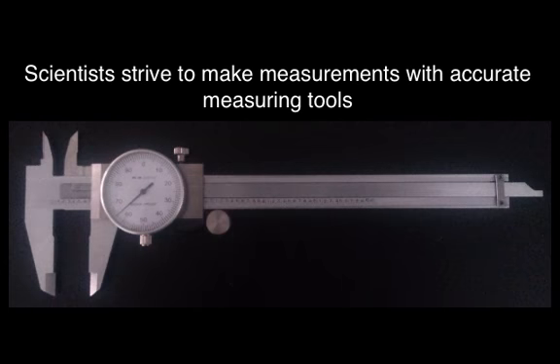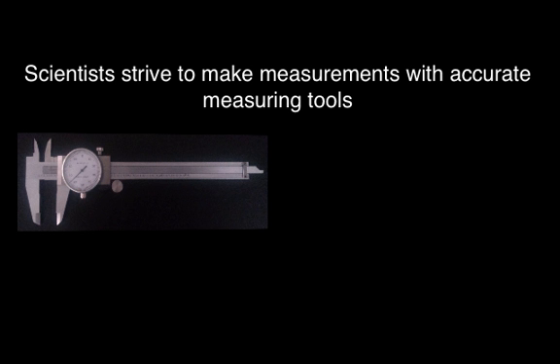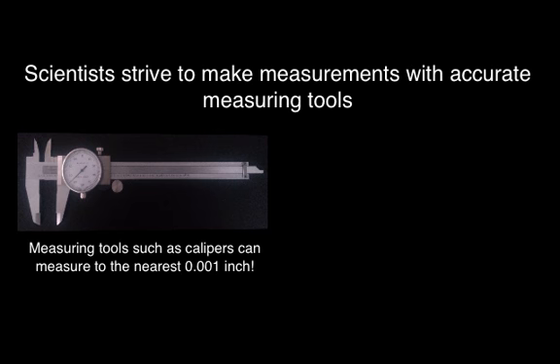When scientists choose to make measurements in the laboratory, they want to choose measuring tools that will give them the most accurate measurement as humanly possible. So for example, if they wanted to measure that culture vial, like we saw earlier, they might use a pair of calipers. Calipers are highly calibrated instruments that, in the case of this pair of calipers, allows us to make a measurement to the nearest 1/1000th of an inch.